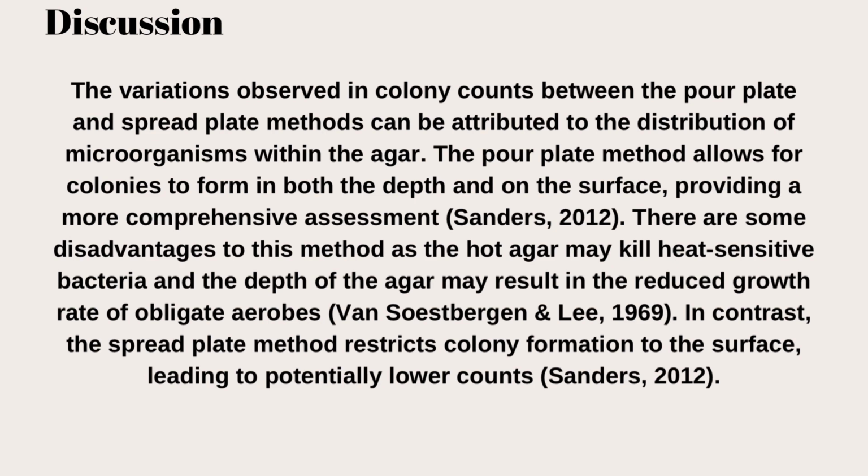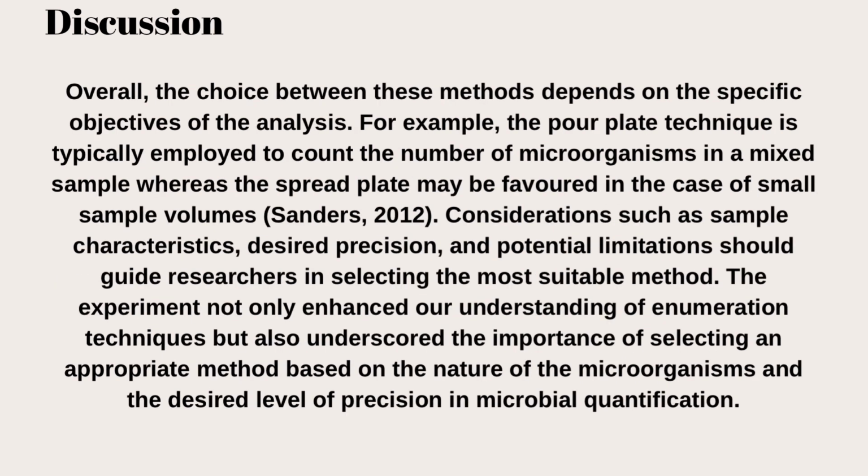In contrast, the spread plate method restricts colony formation to the surface, leading to potentially lower counts. Overall, the choice between these methods depends on the specific objectives of the analysis. For example, the pour plate technique is typically employed to count the number of microorganisms in a mixed sample, whereas the spread plate may be favored in the case of small sample volumes. Considerations such as sample characteristics, desired precision, and potential limitations should guide researchers in selecting the most suitable method.